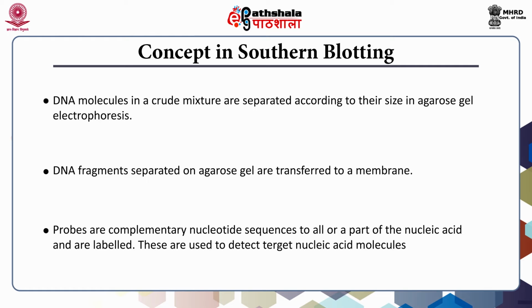In the nucleic acid hybridization reaction, single strand DNA or RNA randomly collide with each other in a number of all possible alignments. Under the stringent condition, only one perfectly matching molecule will hybridize.